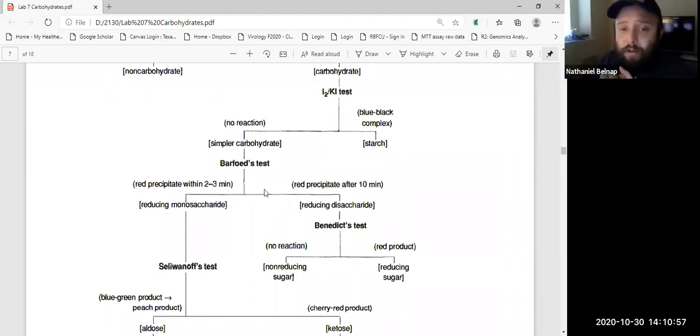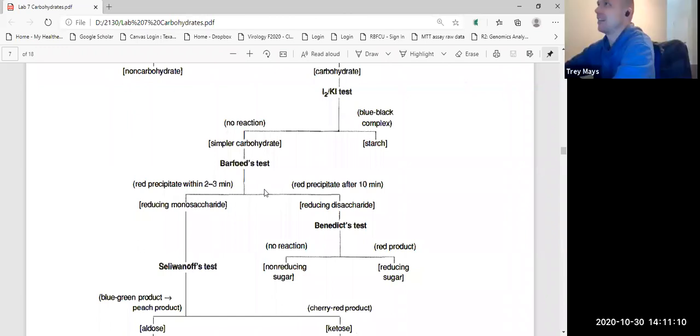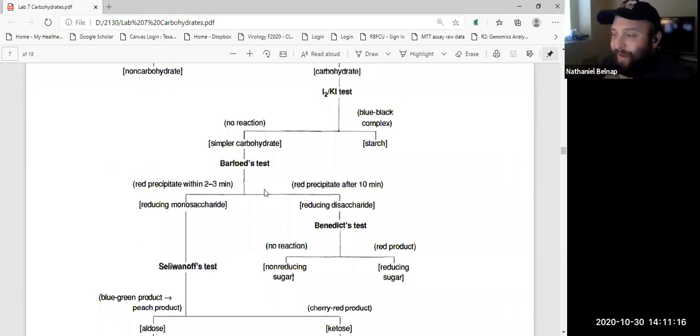Yeah. And also, he said something about Googling it and seeing what it should be like in theory, not just based on this video. Yes, Trey. Yeah, because xylose is a monosaccharide, but it tested out as a disaccharide. Exactly. So it could just be an error of the lab, right? Not everything's gonna work perfectly. And trust me, if any of y'all are going into research, you know that things don't always work out perfectly every time for whatever reason. It was just bad luck that day, right? It is 2020, so it's been a bad year anyway, right?